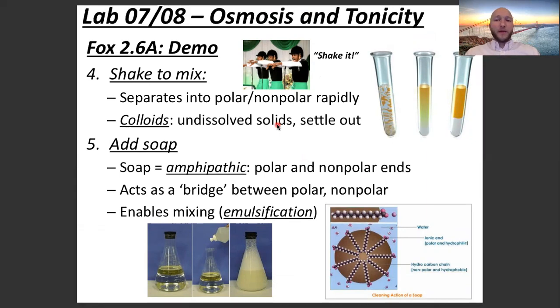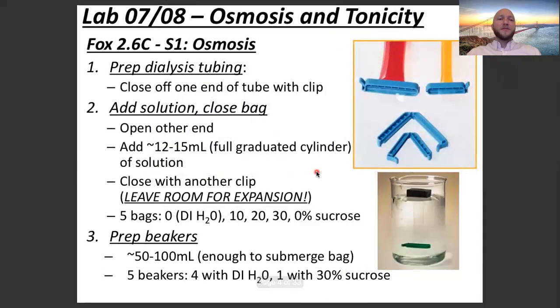What's going to happen after we've added soap? Well, the layers are not going to separate out again. They're going to blend together. We're going to have one solution that's a blend of the water layer and the xylene layer. It's all going to blend together. And why is it going to blend together? We'll talk about that in the discussion. Think about it though. All right, so moving on to FOX 2.6c.